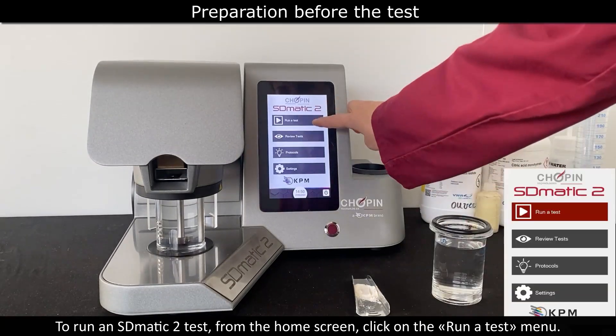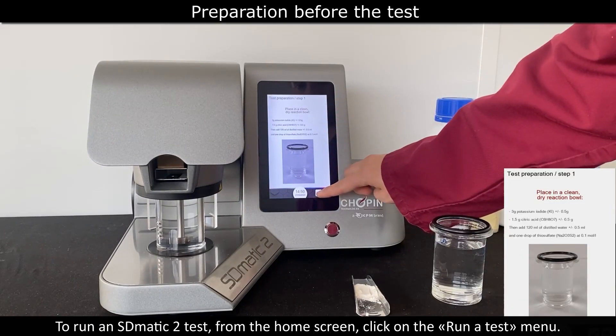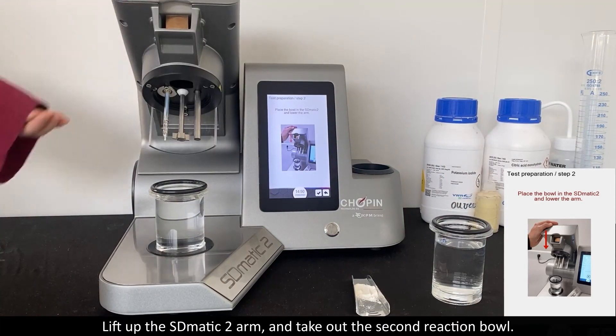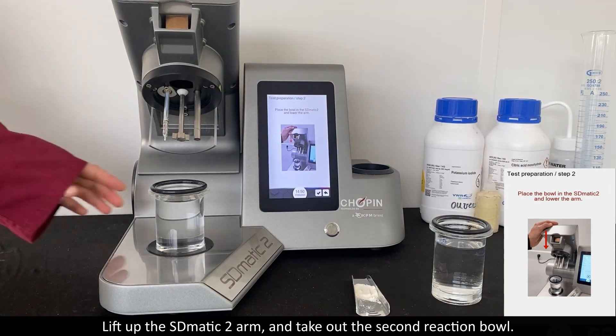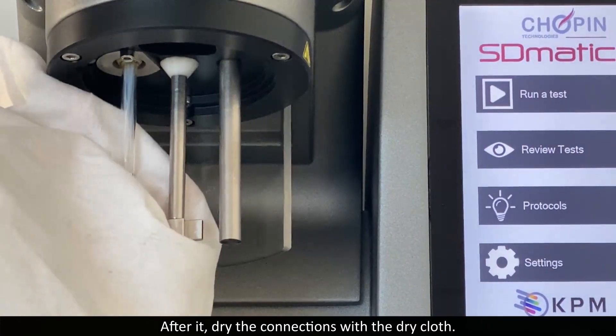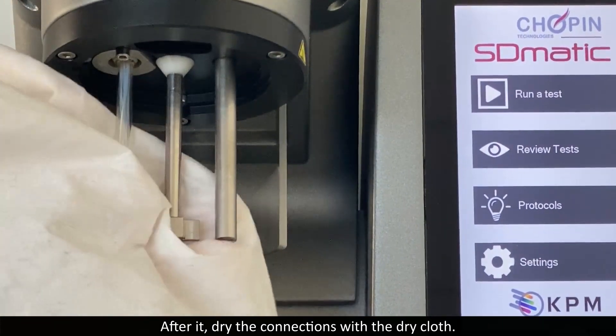To run an S-Domatic 2 test, from the home screen click on the run test menu. Lift up the S-Domatic 2 arm and take out the reaction bowl. After that, dry the connections with a dry cloth.